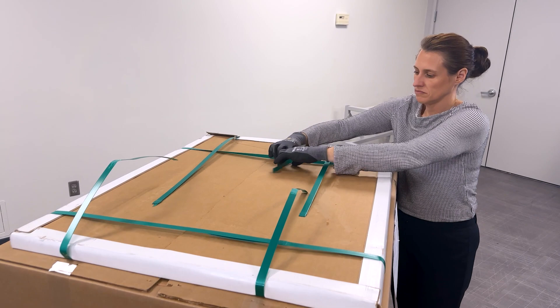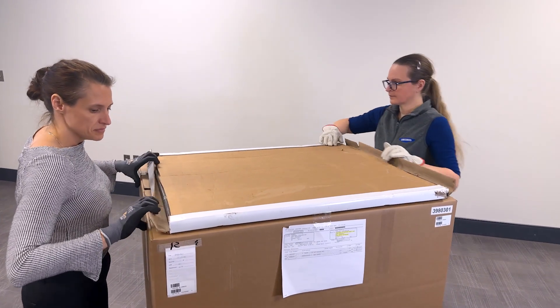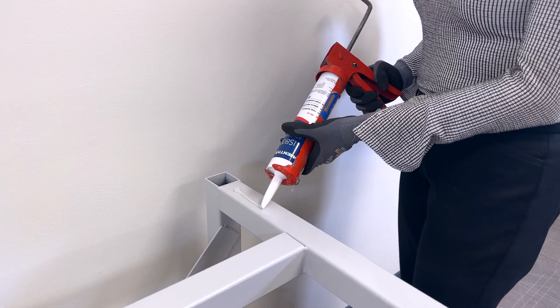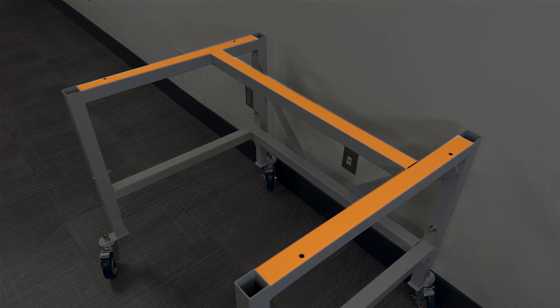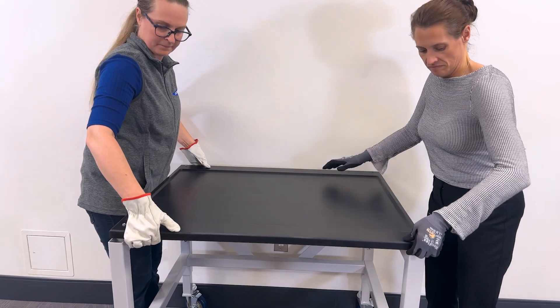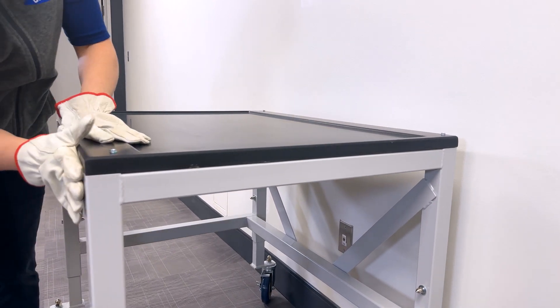Using an adjustable wrench, adjust the feet of the telescoping base stand to level it — multiple feet may need to be adjusted, ensuring the stand is level from front to back and side to side. Now, unbox the work surface by inspecting and removing its cardboard box. If you discover any damage, take photographs and contact the freight carrier to file a claim. Use caution not to scratch the work surface as you open the box. Before setting the work surface in its final place, apply structural double-sided tape, structural adhesive, or silicone sealant to the top surface of the base stand to secure the work surface.